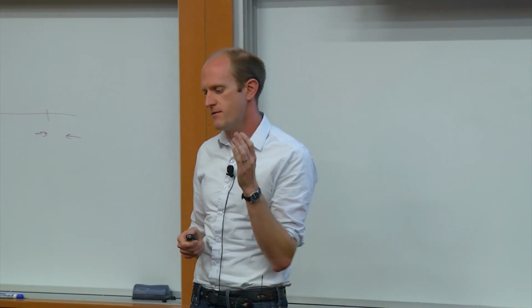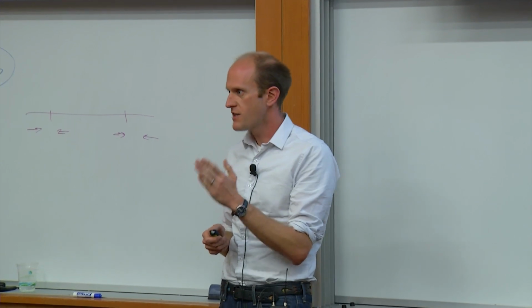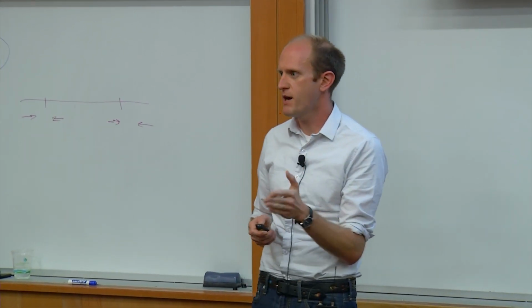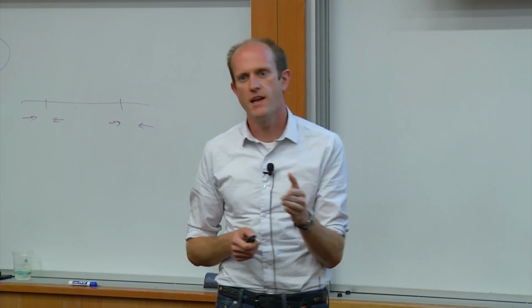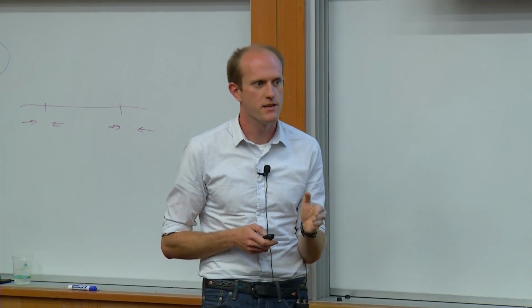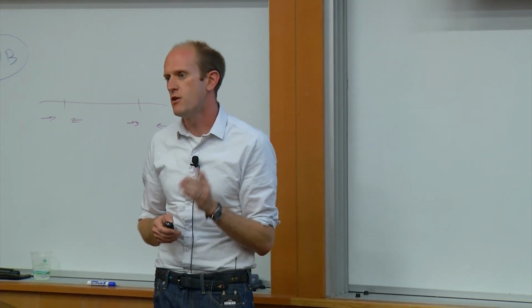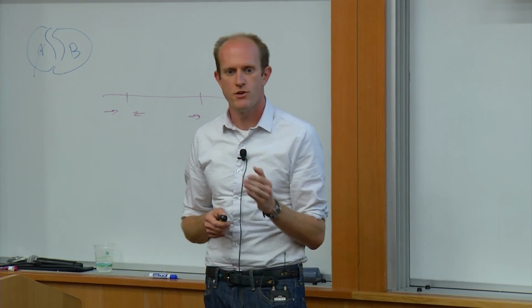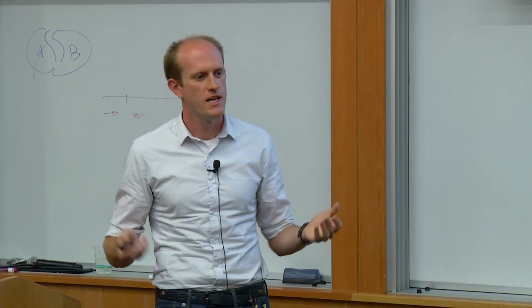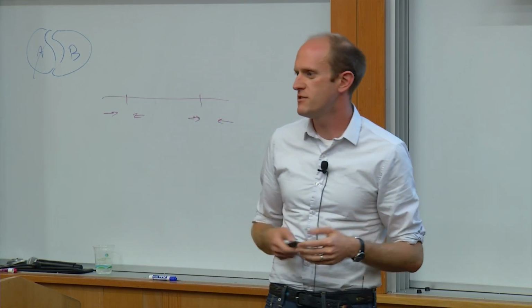So if you have a very high-scoring guide and it happens to lie in an intron, near an intron-exon boundary, this tool will not call that as a gene hit. Okay? It will only call exons as in-gene hits. So you should be careful about that based on what you're trying to do. Okay? So I think this is one of those cases where it's buyer beware, and users should kind of know what they're doing.